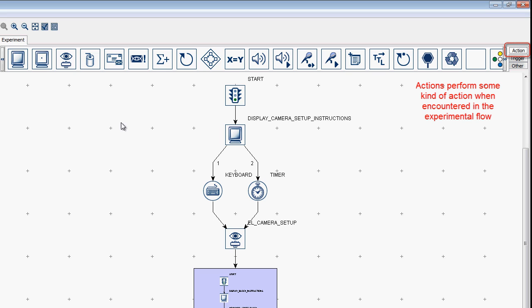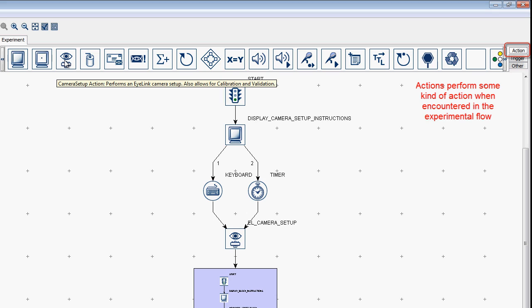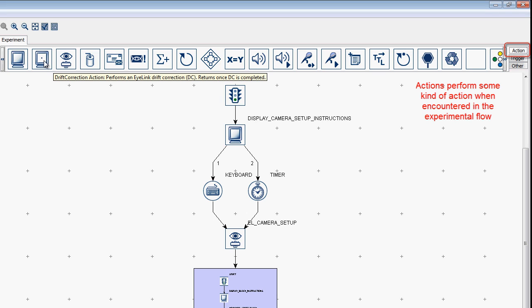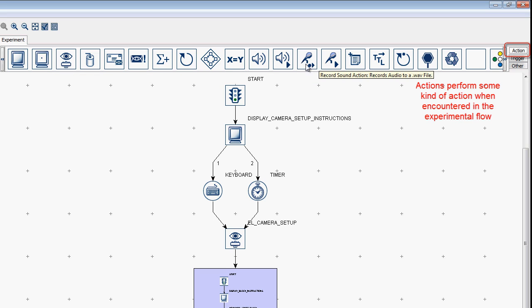The nodes in the Action section perform some kind of action when encountered in the experimental flow. For example, the Display Screen action can be used to present visual stimuli to the Display PC monitor. Note that you can use actions to do things like put the system into camera setup mode, do a drift check or drift correction between trials or blocks, or play or record audio.